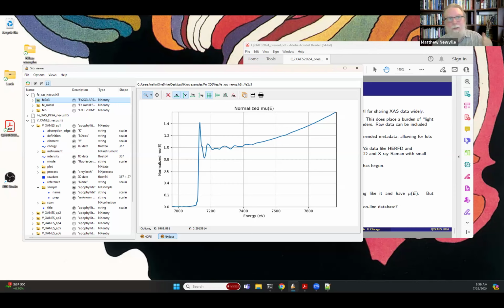But the person who takes the data, or the person who took the data and gives it to a friend of a friend of a friend, it might work to say this, because this one file has those two groups in it and they were taken at the same time at the same beamline. You can detect that, and the sample name is the same. You can infer that, but yeah, that's a tough question. That's tough to do. I hope that's a sufficient answer.